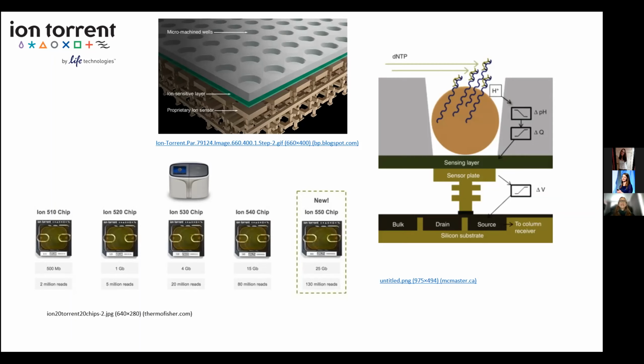Beneath the microwell is a sensitive layer, and below is the ISFET sensor plate, which is an ion sensitive field effect transistor, used for measuring ion concentrations in solution.